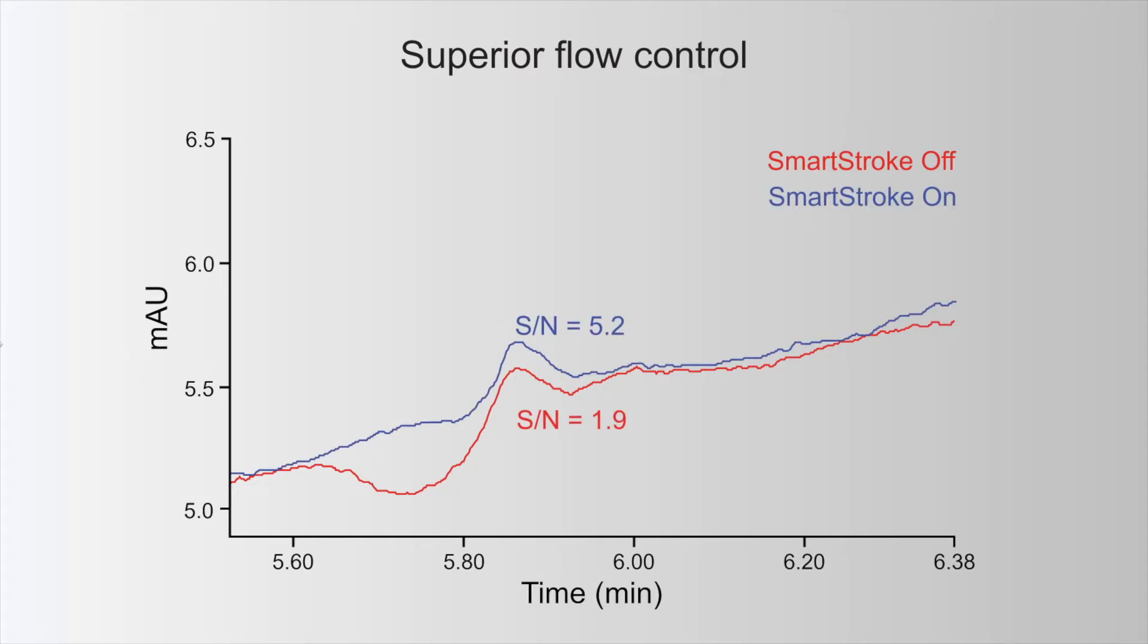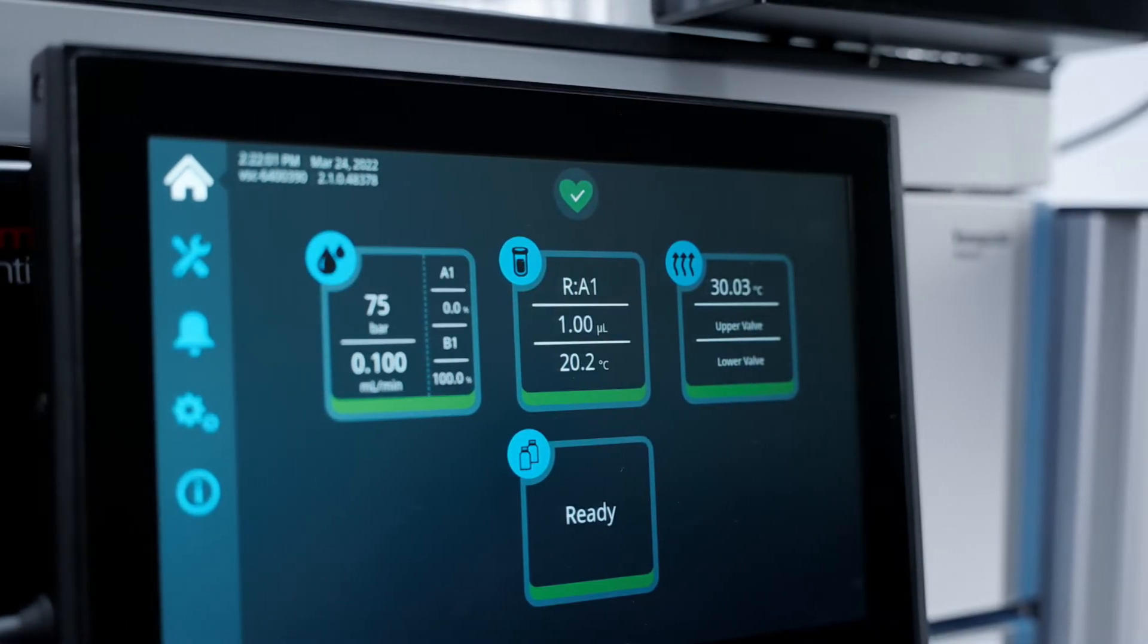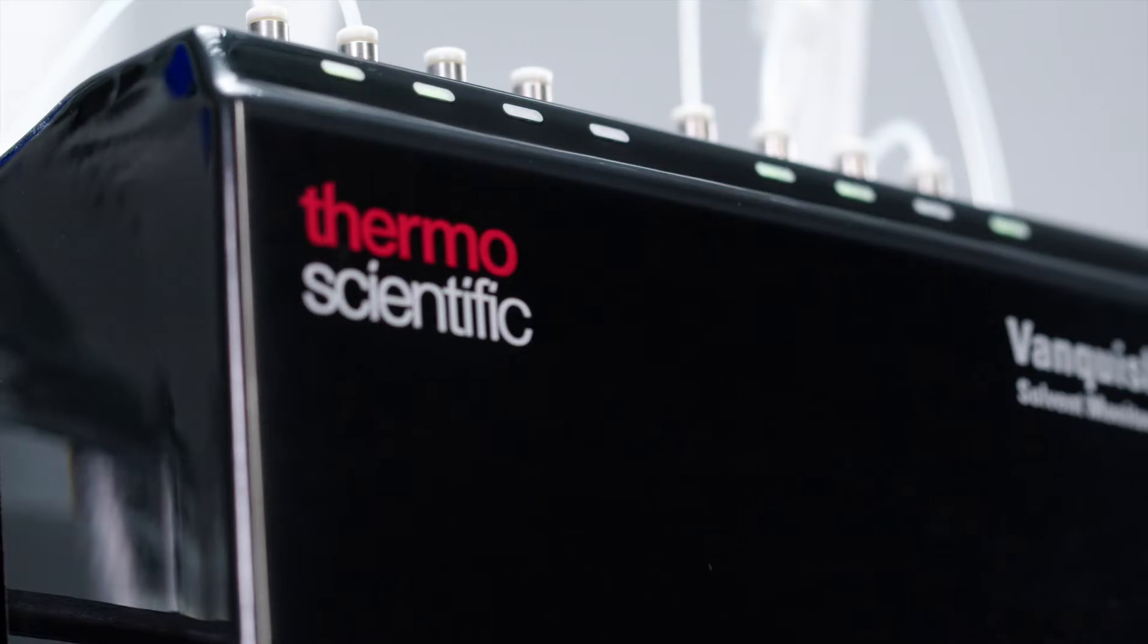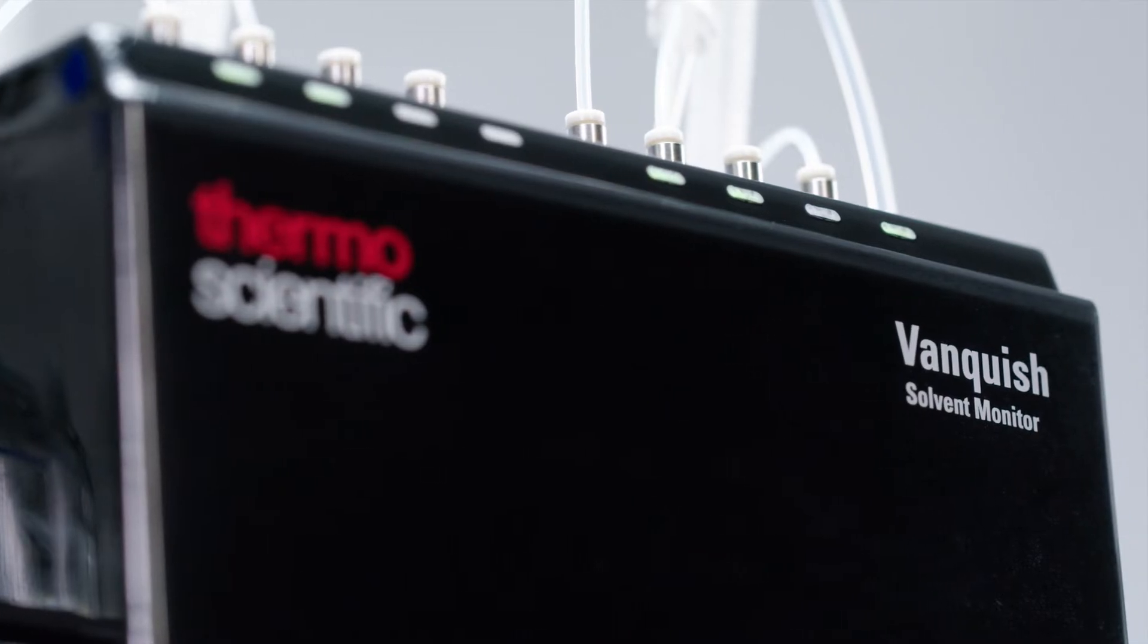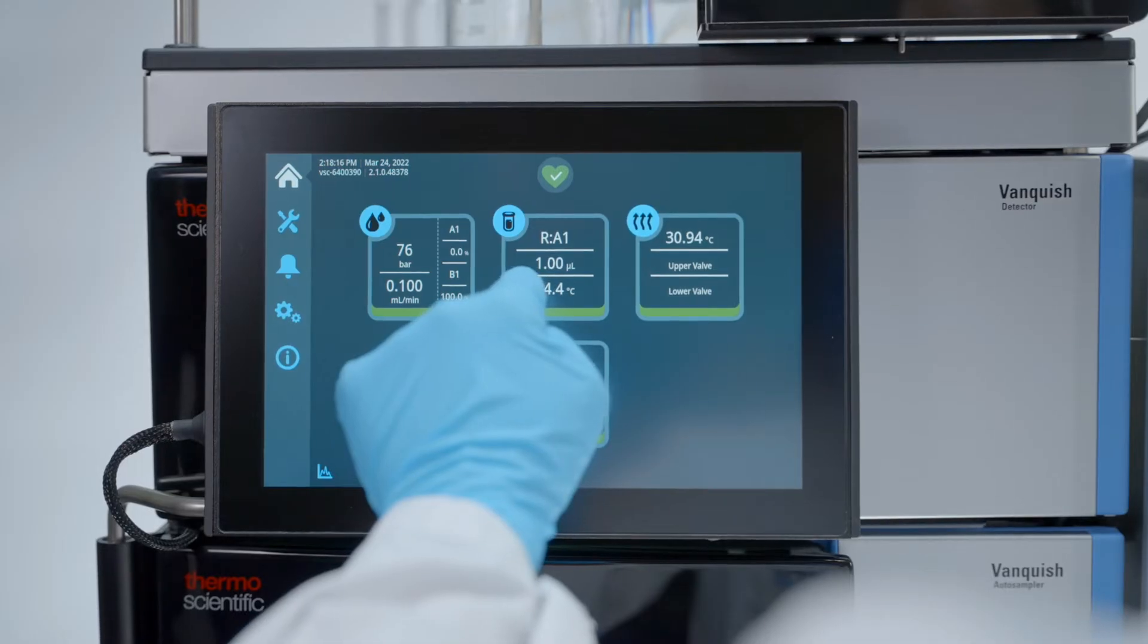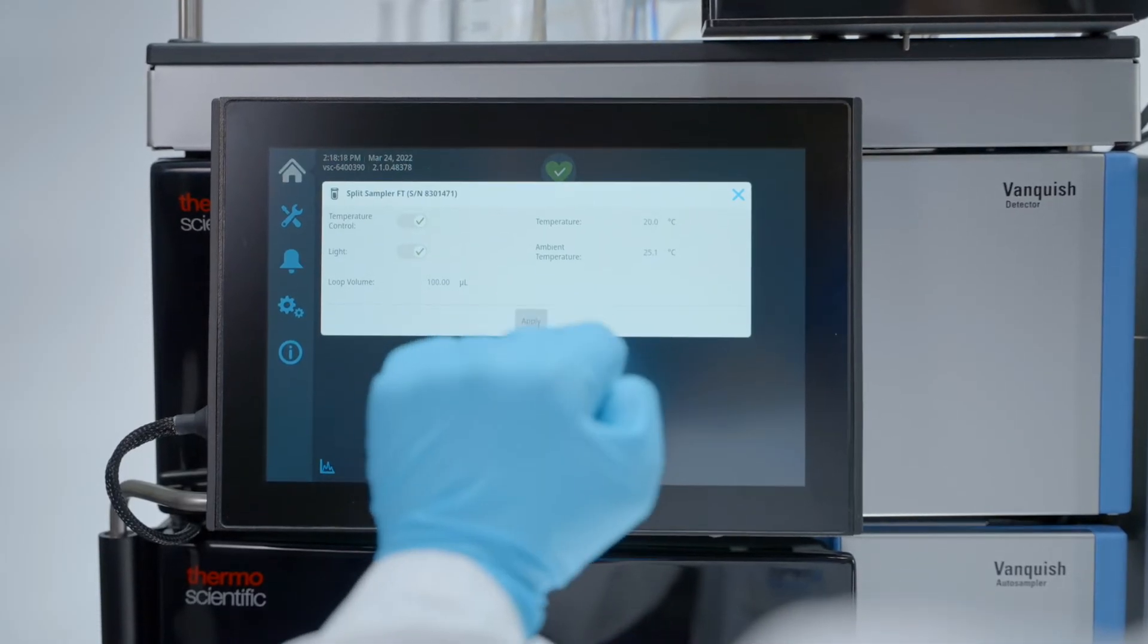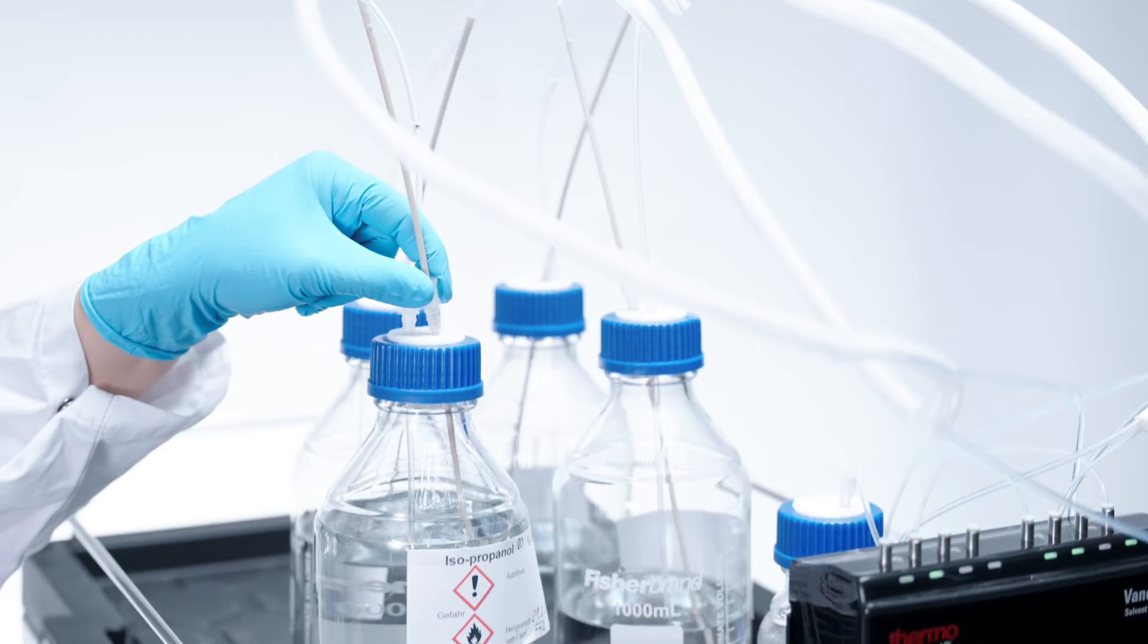The Vanquish platform also exemplifies intuitive operation through features like Vanquish solvent monitor and touchscreen user interface for on-system and remote instrument control and step-by-step maintenance tutorials.